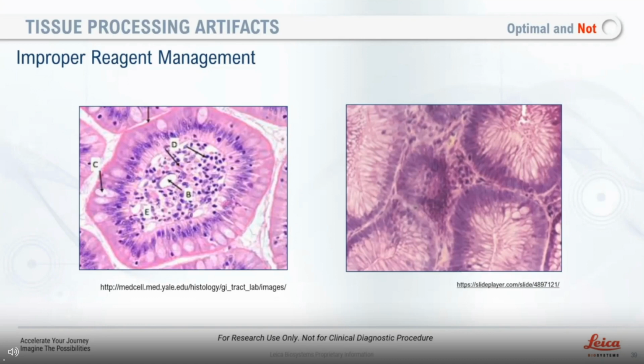Oh, I love this question because I've been a histologist for over 40 years, and I think we never really thought about this type of question. For the most part, tissue histology can be pretty forgiving. But we have found with the introduction of molecular testing in histology that we have to be a little bit more aware of what we're doing in the laboratory. And this is a great question because it actually addresses this.